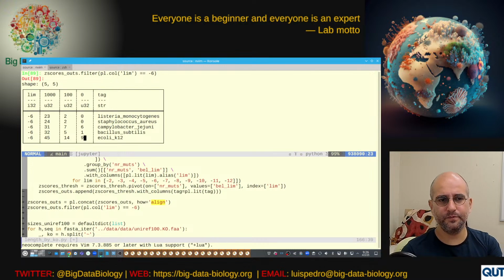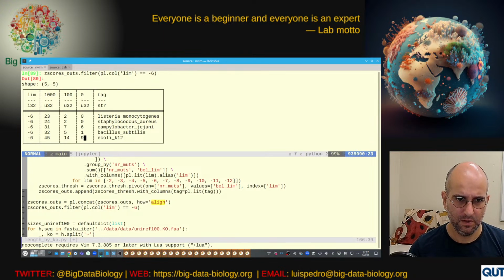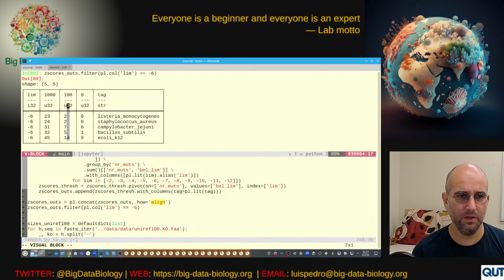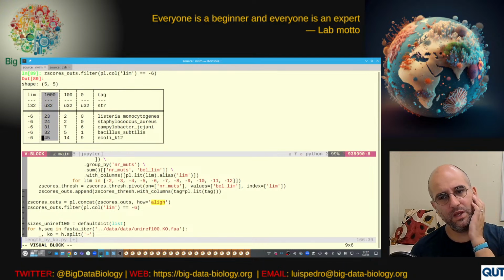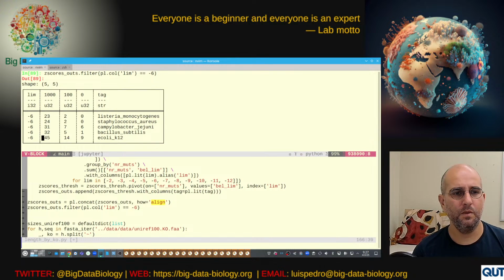But it's still hard to find a good threshold, because right here E. coli already has 9. It's actually weird that E. coli has that, maybe a bit of an artifact of how we're doing things. So let's set it at, say, 15, and then maybe we would miss this column here, unfortunately, but we would get that one. This is how I was thinking about it until about 5 minutes ago; what we've been trying to do in the last several sessions is maybe find a way to clean these up.